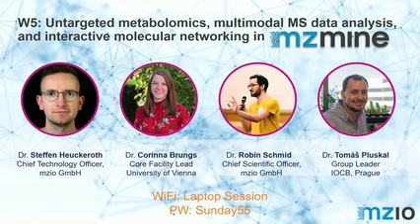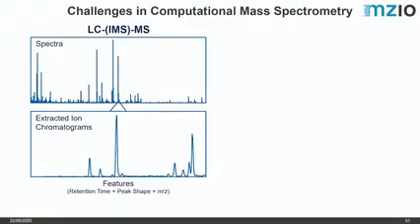During the hands-on session, if you cannot follow along or you have some problem, then please feel free to raise your hand. We have some amazing helpers on the side that will try to assist you. And otherwise, please don't hesitate to raise your hand and ask a question. So, now I would say we just start with the workshop.